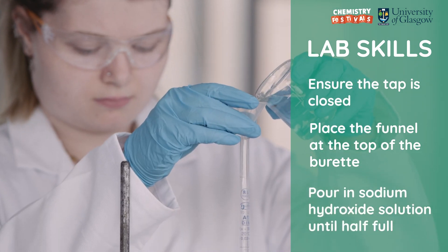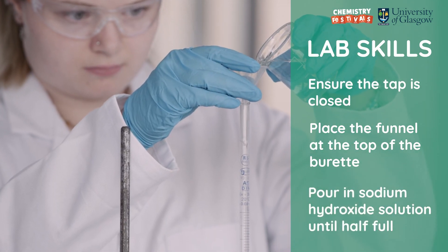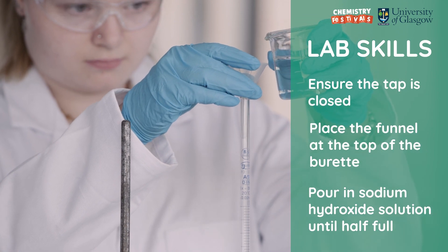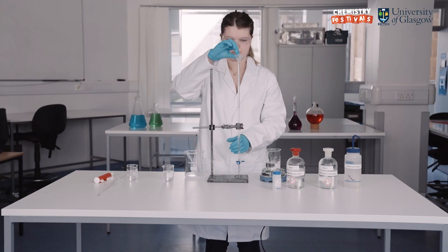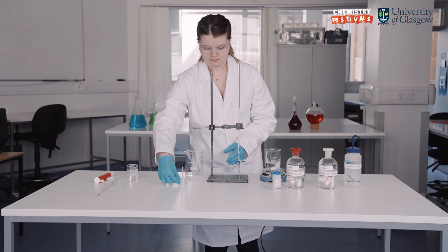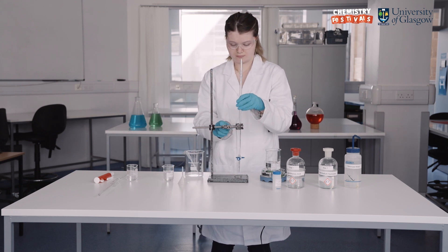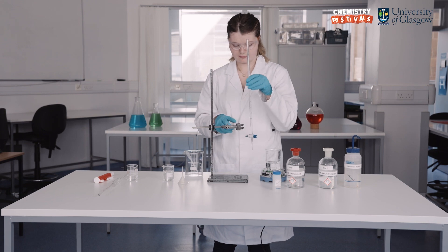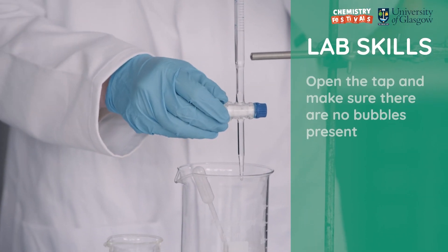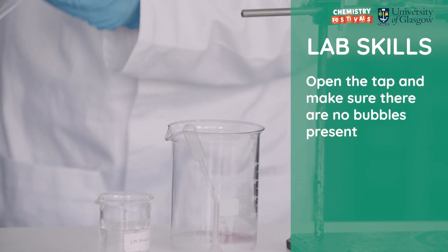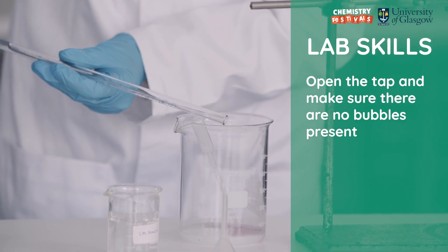I pour in some sodium hydroxide solution to make sure that the burette is only half full. I open the tap to make sure that the sodium hydroxide moves through and there are no bubbles left in the underside of the tap.